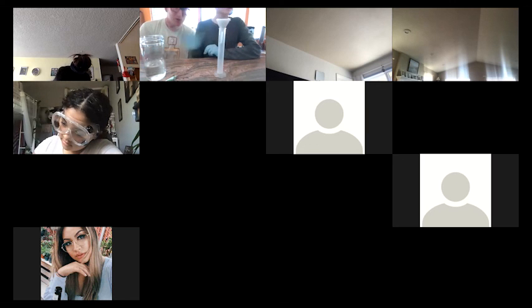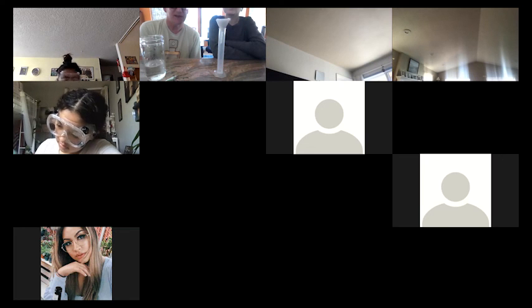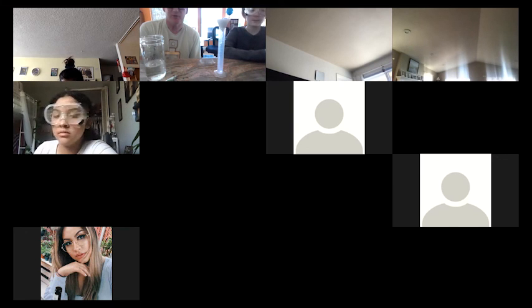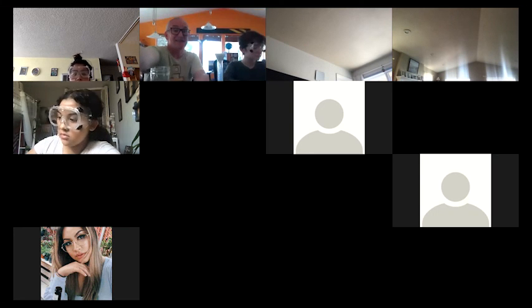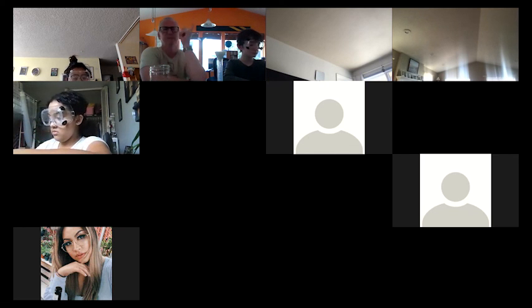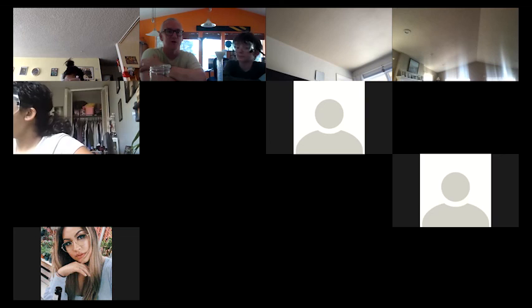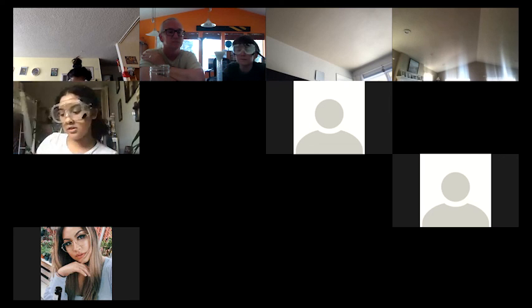So next week, we're going to be doing a lot of reactions. So it's really important. And some of them involve fire. So I would like to have more people with their cameras on, because I want to make sure you're not catching on fire. So if you've looked at the procedure, I think we're doing 7 chemical reactions. And I did this with the 410 group last week, and yeah, it's kind of chaotic because there's so much going on. So this stuff, even though it has copper in it, it can go down the sink.